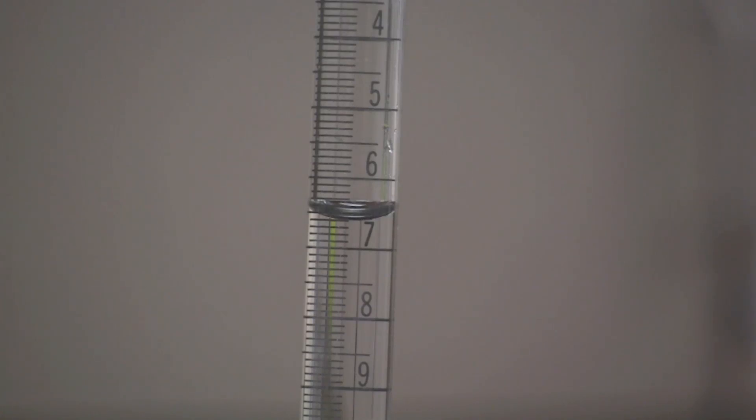Read the volume of sodium hydroxide on the burette and record this amount in your lab notebook. The entire titration should be repeated two more times and then calculate the mean or average volume of the sodium hydroxide solution required to neutralize the hydrochloric acid.